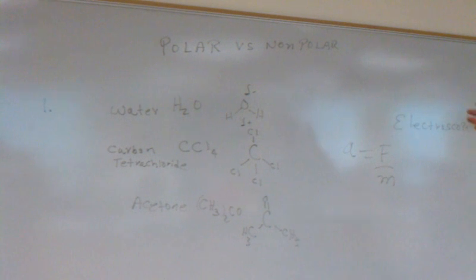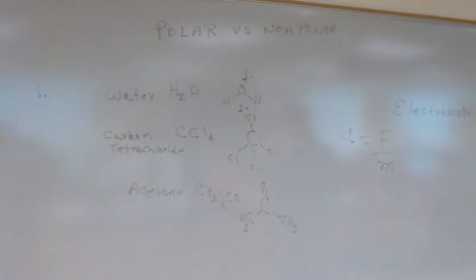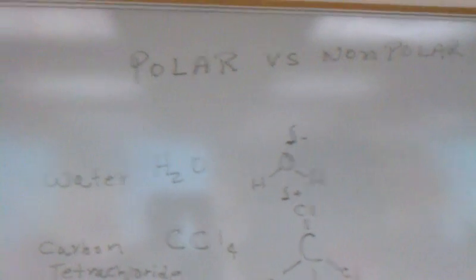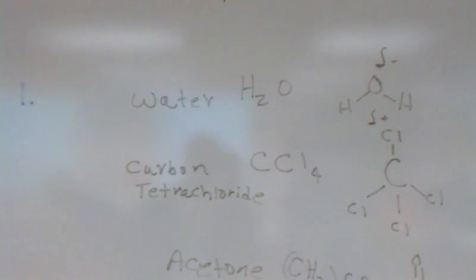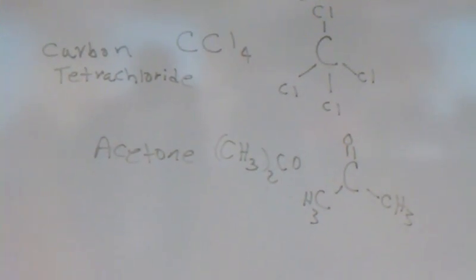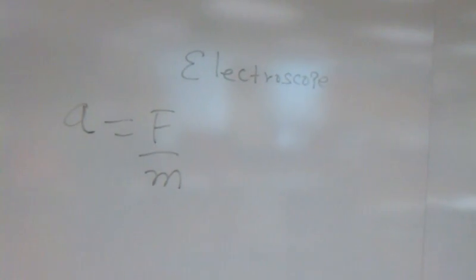On the purpose, is it investigating how the streams are attracted to electrical charge? Our purpose is to investigate polar and nonpolar compounds. The spin-off of the experiment was that in doing so, we actually discovered something about the density of the two different compounds because of the way they behave with the charged rod. It's just a little extra added spin-off. Okay, so get your notes clear to yourselves.